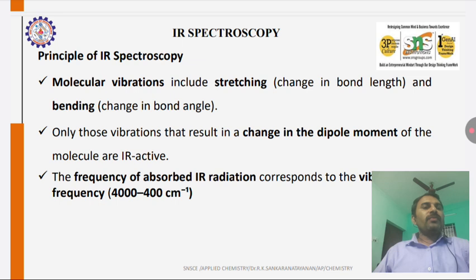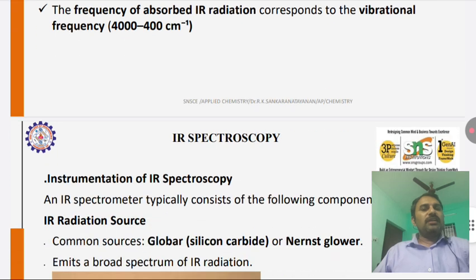And how is it going to affect the dipole moment? There will be changes in the dipole moment. Dipole moment is the separation of positive and negative charge, and how it is expanded. And what is the IR region? 400 centimeter inverse to 4000 centimeter inverse. This is the vibration range of infrared spectroscopy.